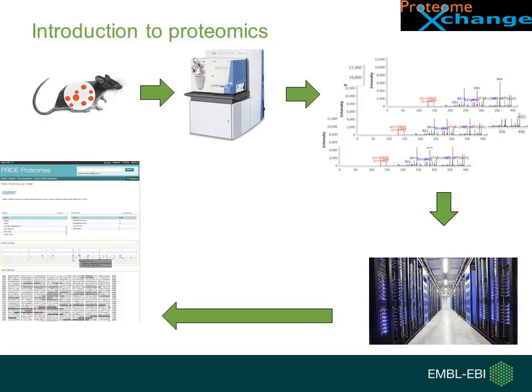These are then processed, searched against databases, which is a relatively compute-intensive process to generate the output data, namely which proteins are thought to have been in the sample and in which quantities and in which specific forms.